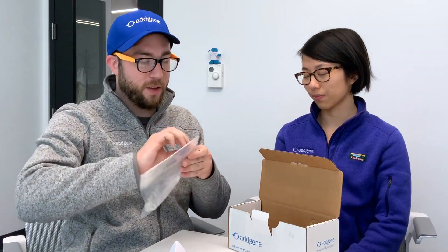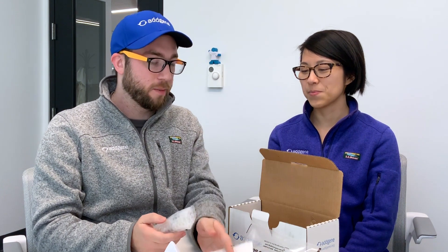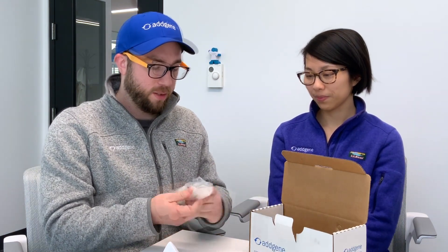In here you're just going to tear this open. We have an absorbent sheet just in case there's a spill — it'll absorb all the liquid. And in this bubble wrap, we'll have your shipments: your stabs, which you'll promptly store at four degrees.